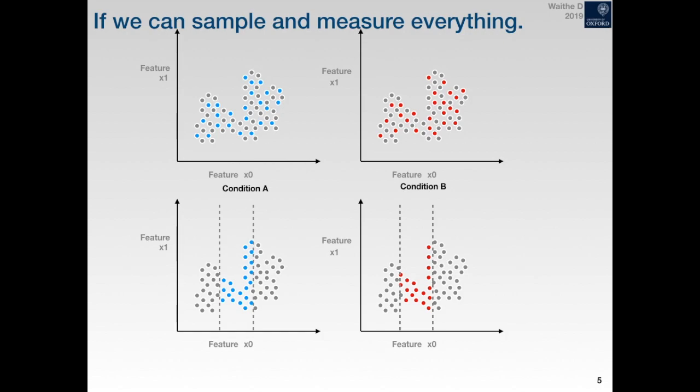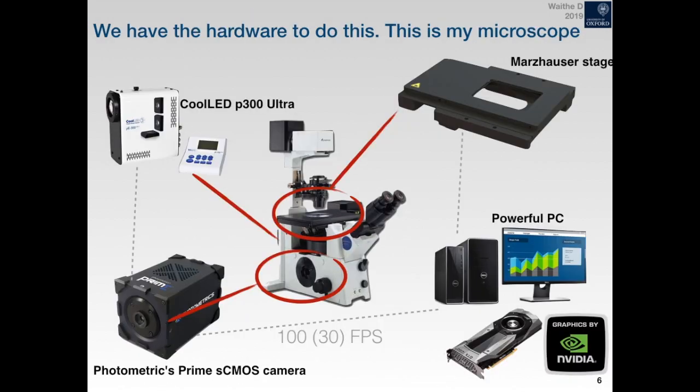Yeah. So how do we do that? What's the technology behind it? Well, I believe that we shouldn't all buy big screening microscopes for hundreds of thousands of pounds. We should be able to do this with custom microscopes and affordable microscopes.